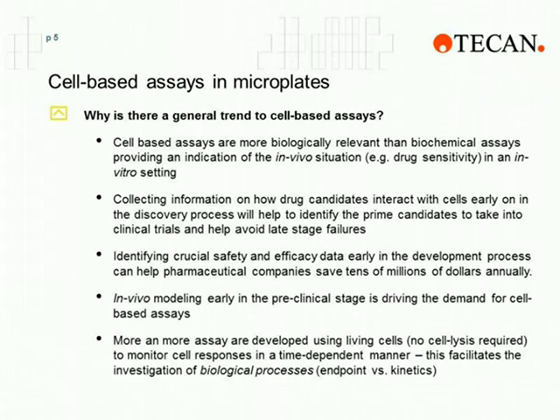More assays are developed using living cells, and this is really an issue we face and have seen with customer requests: how can we help people going into living cell assays, particularly the differentiator between endpoint and kinetic assays, giving really great biological process information, high content, compared to cellular and non-cell-based assays.